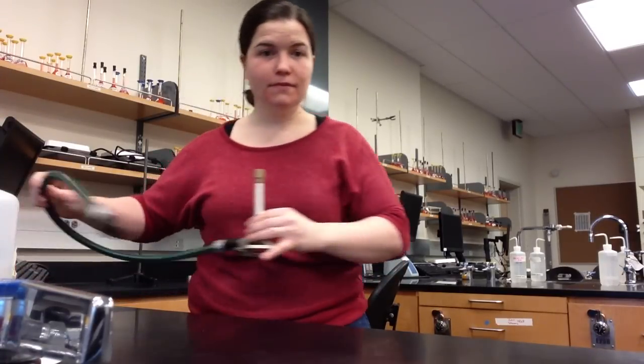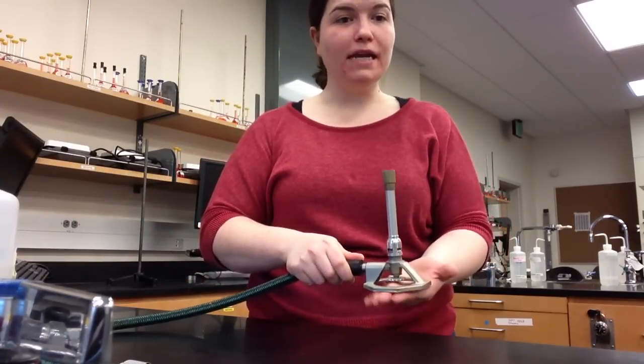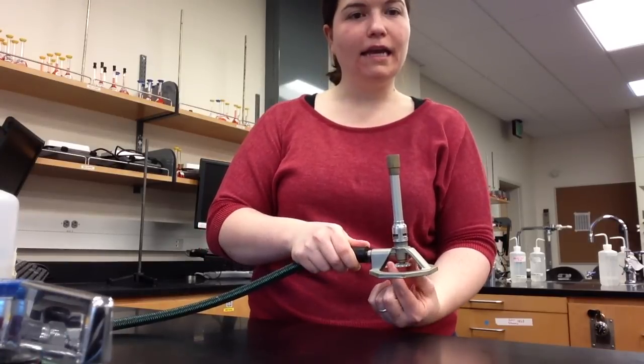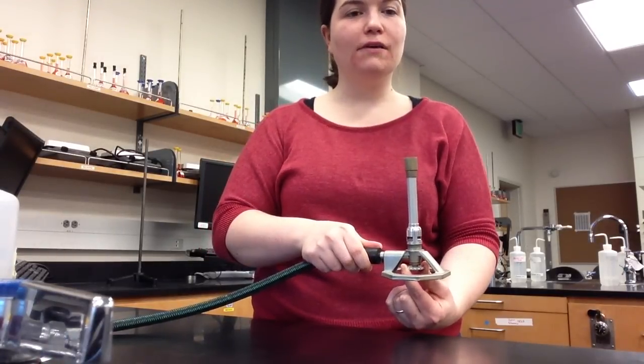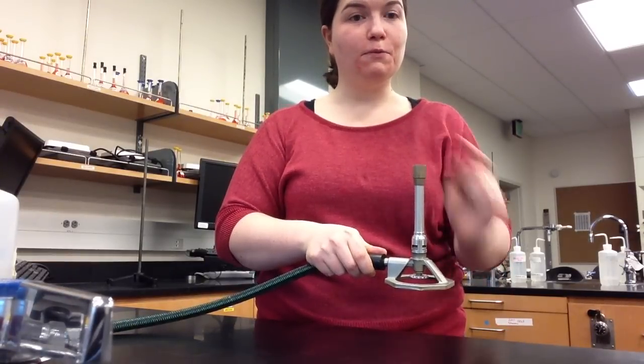Lab safety for this lab starts with the Bunsen burner, which I have right here. A Bunsen burner will produce a flame in the lab. It has a base on the bottom, a gas control valve which allows a small amount or a large amount of gas in, and the barrel of the Bunsen burner where the flame will be produced.